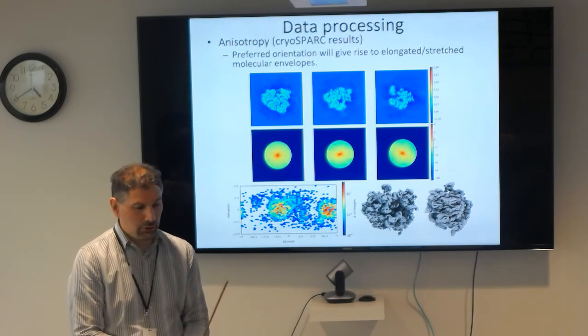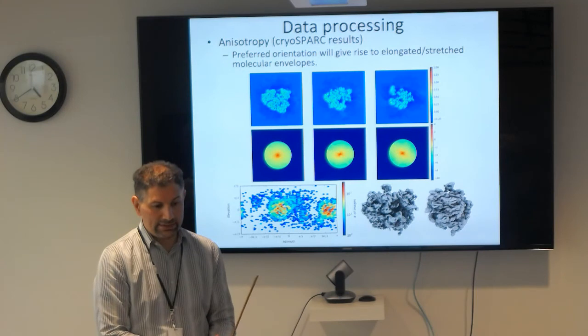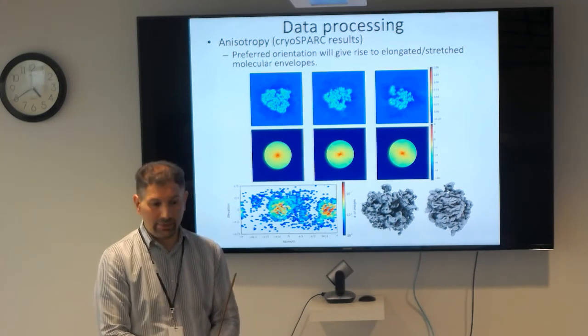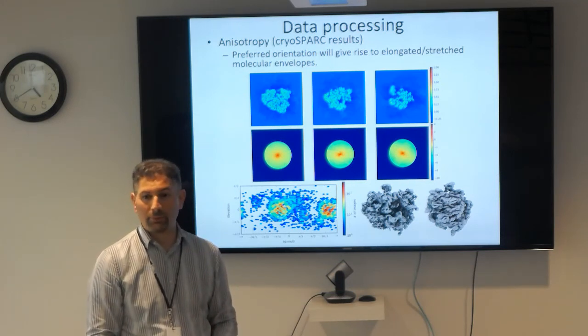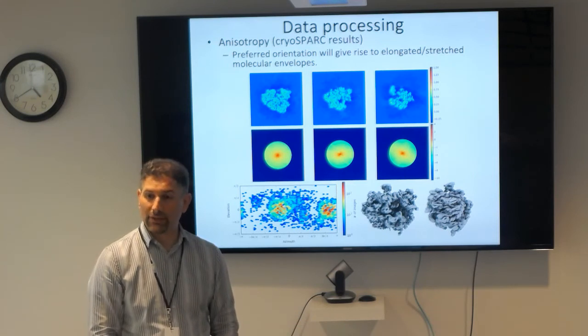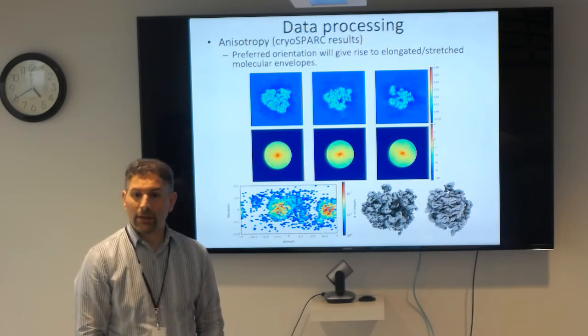So generally what we do, if we work with any sort of ribosome project, is collect 0 degrees and collect 15 degrees, half on each, and then process that, and hopefully there won't be any anisotropy. And if there is, we'll collect another day at 30 degrees. Okay? Yes? So you will keep doing the 3D classifications a couple times. Yes. To fish out the anisotropy. So you could do that.